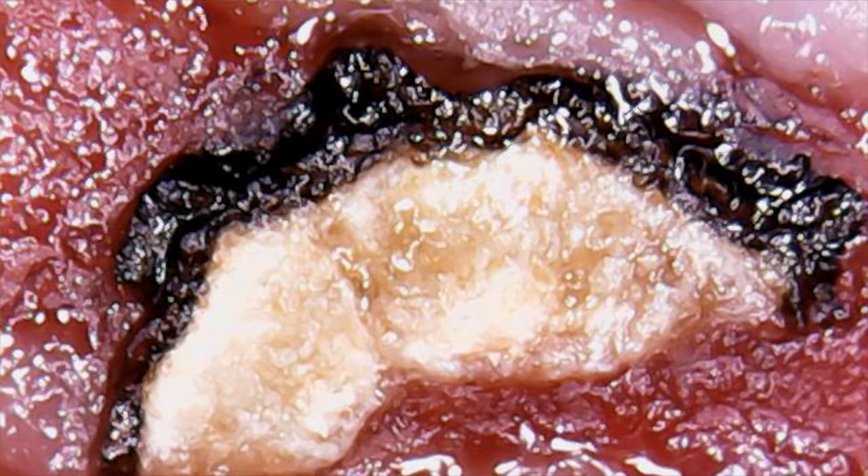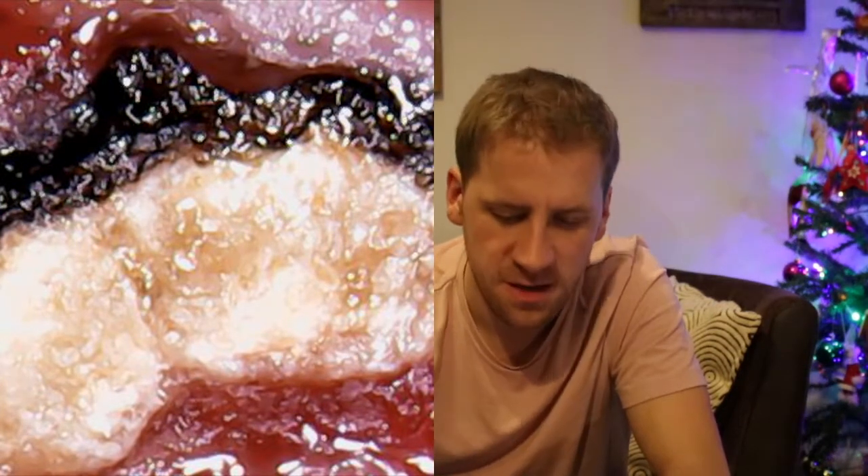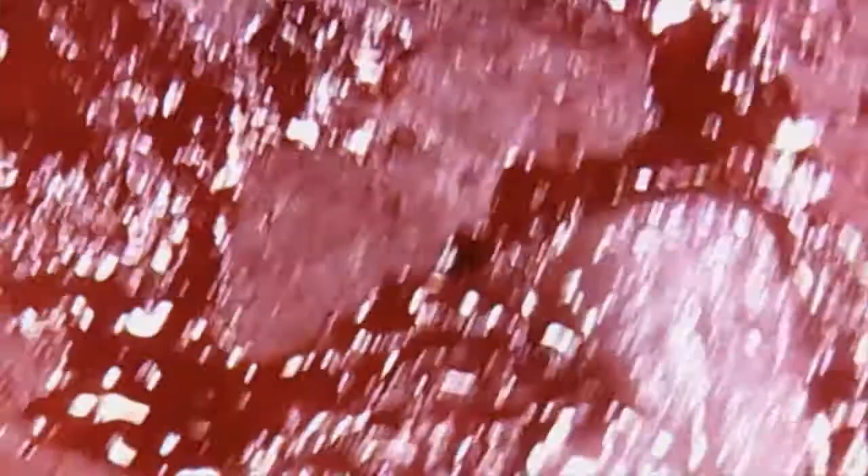Don't mess about. This is in the dried section. There's another one of these black-rimmed things with a hole in the middle. I don't know what it is but I'm going to say it must be some sort of mould, which is fine. If you know what it is let me know in the comments because I would appreciate that. I don't claim to be any sort of salami expert. Coming around further around this dried out bit — you can see it's a little bit loose there, very greasy right up close to the microscope. You can see the lines of the muscle in the pork, and it's all rolled into a sausage and then thinly sliced. This is maybe a bit less than a millimetre thick.